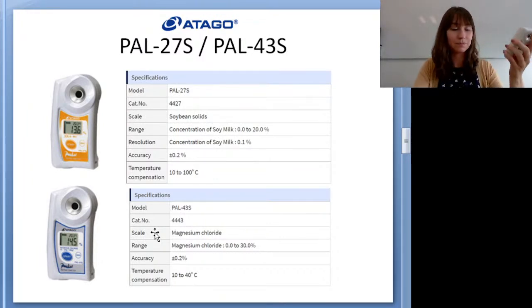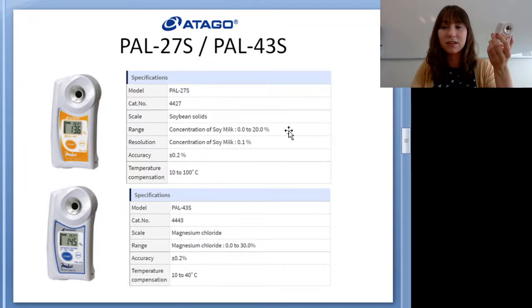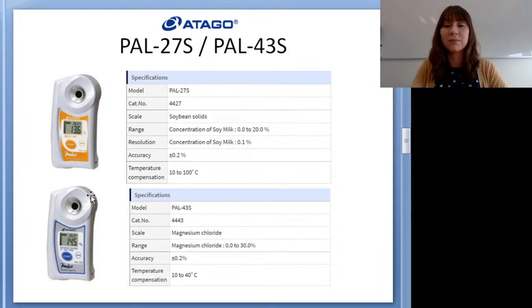For measuring both soy milk and the coagulant digitally, we have two different models. The PAL 27s measures in the soy milk concentration scale — this is what you use for the actual soy milk. The PAL 43s measures in the magnesium chloride scale, so that's a separate unit for the magnesium chloride percentage. One advantage of the analog is that both scales are in one device, but if you go digital you do need two units.